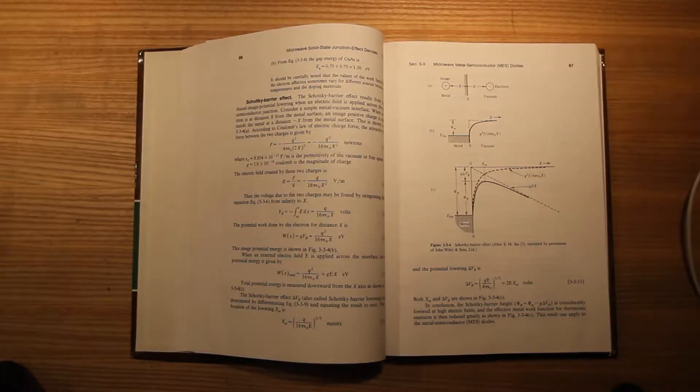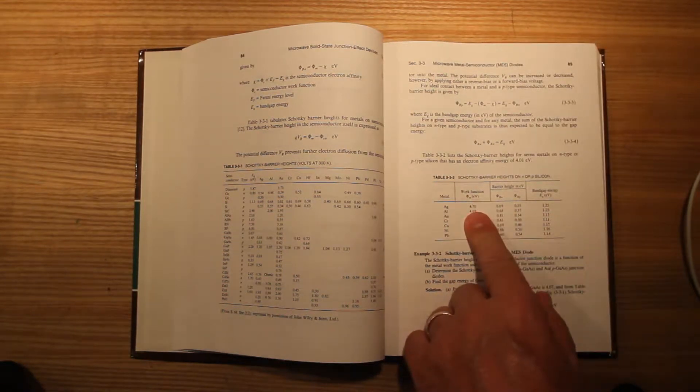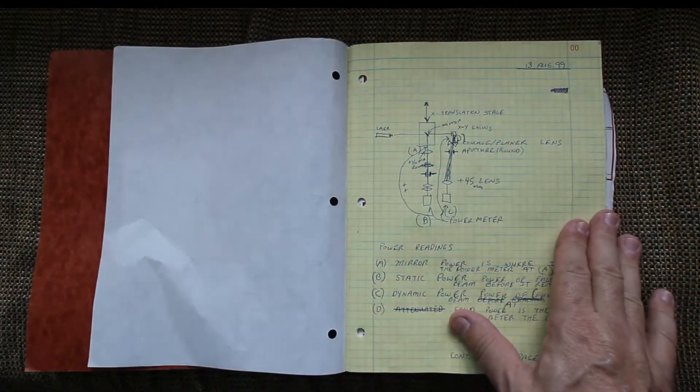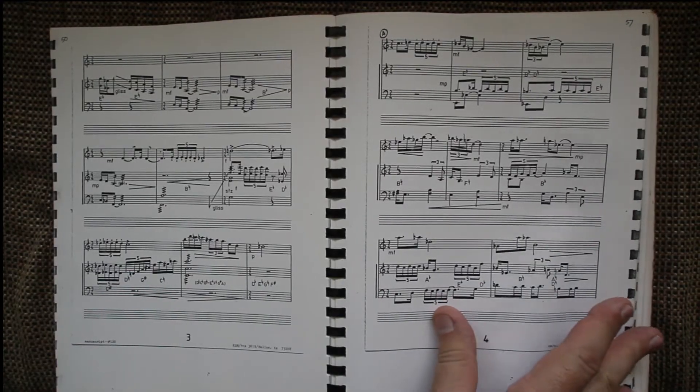No chemicals, powders, or fuming is necessary. The paper and the fingerprint are not altered or damaged in any way. This allows the fingerprint to be lifted and saved and processed for potential DNA.